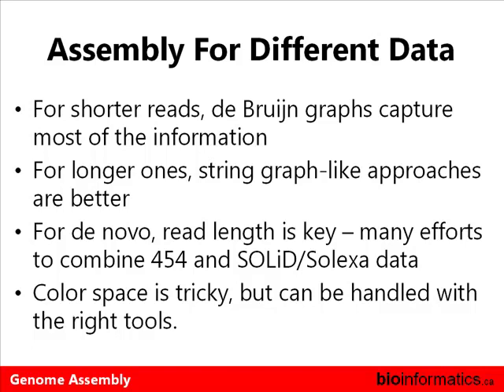So if you're a biologist, you shouldn't have to know that color space exists. That's the goal of computation, of the computer scientists in the room and of the bioinformaticians in the room. You should be able to hide color space away from the biologist by making everything look like letters. And the key to this is the right computational approaches.